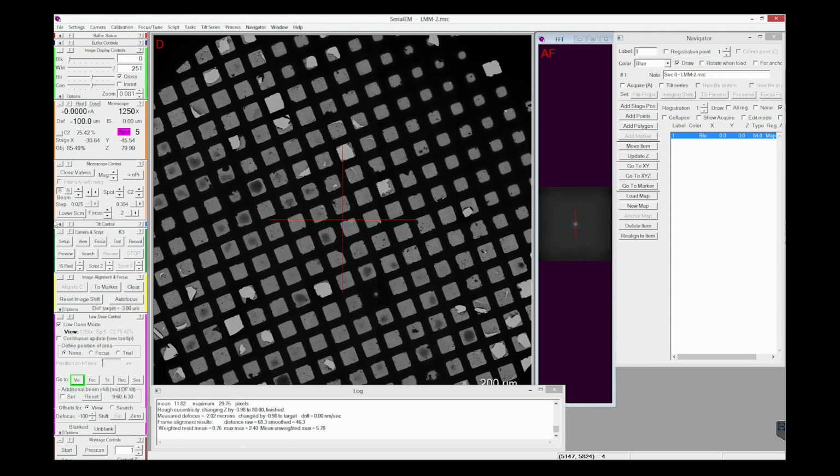So to do that, you'd start with a thin square and then move to a thicker one, and then finally a thicker one after that. So looking at this grid, I'm going to start somewhere around the middle and then move to maybe one of these grid squares with a density in the middle. The grid squares with densities in the middle are generally uncollectible. If you're in a pinch, your particle's difficult to freeze, it aggregates. Sometimes you do want to look for those, and you look along the edges. So they can be useful to look at.